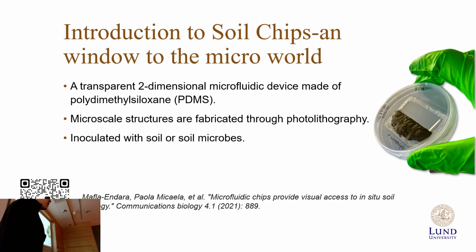My background is mechanical engineering, you may be wondering, but I work closely with soil biologists, helping them build up this system. It's called soil chips. I consider it a window because soil is opaque. You can't really see live how the bacteria and fungi interact with each other.